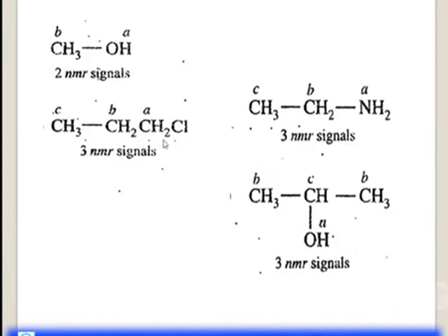And for this kind of molecule, another, you can see these 2 protons are equivalent in nature, these 2 protons are equivalent in nature, and these 3 protons are equivalent in nature. So how many signals will we get? 3: 1, 2 and 3.